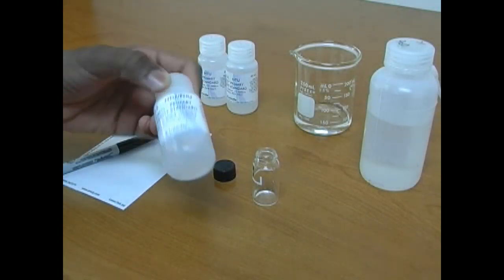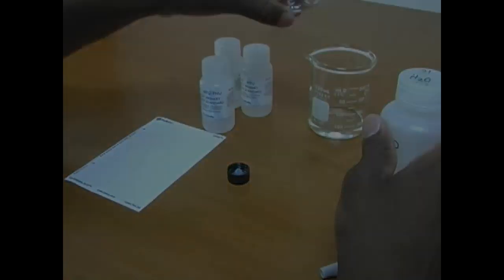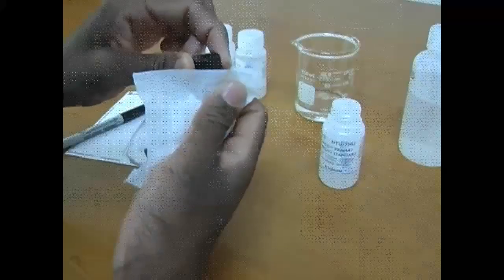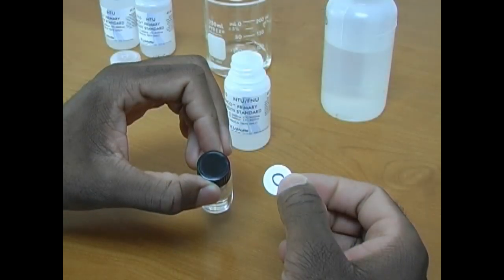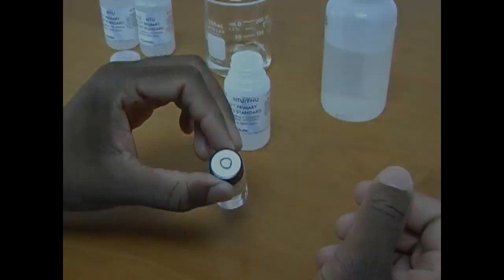Begin by inverting the standard, rinse the sample tube, and fill the tube with 0 NTU. Dry the tube. On the labels provided, write 0 for the 0 NTU standard or the standard value used, and place the label on the top of the tube.